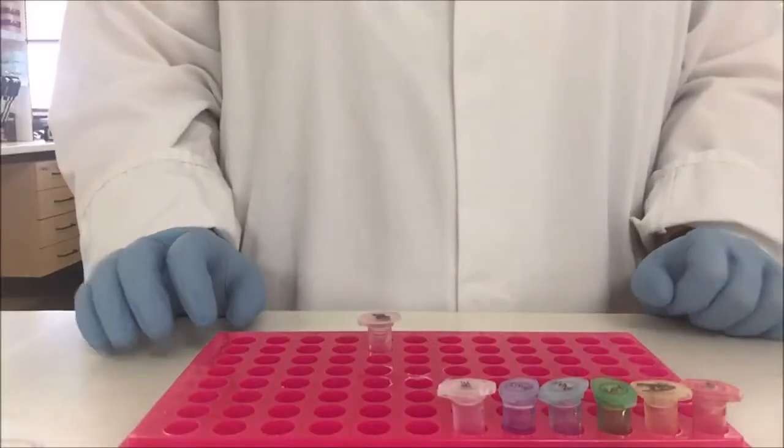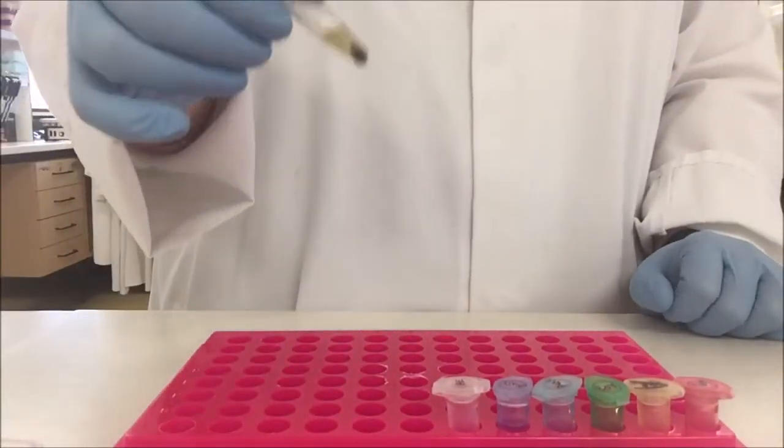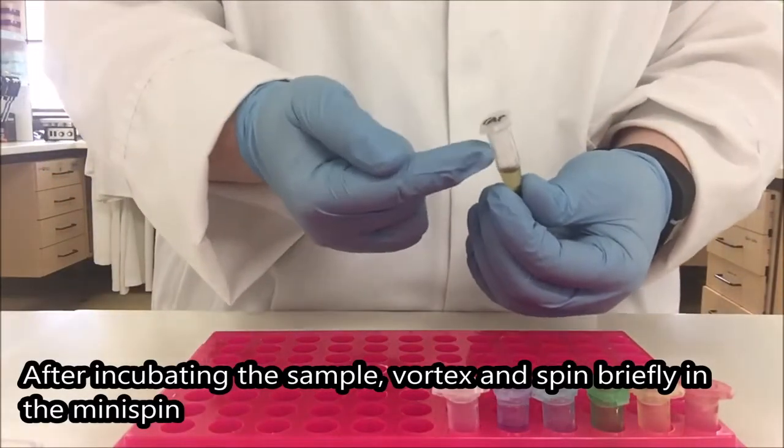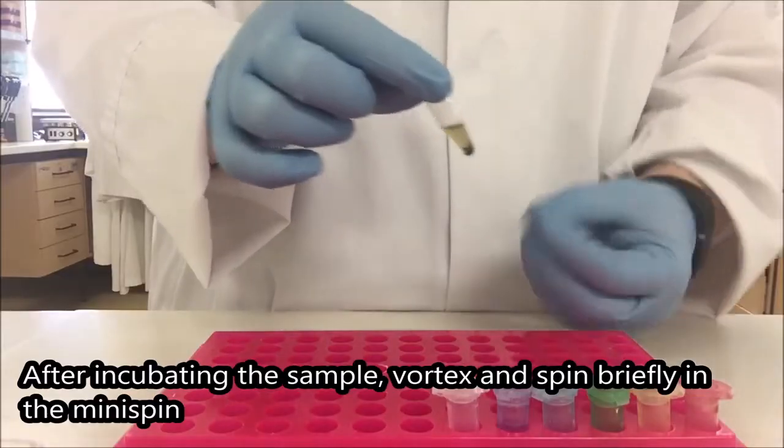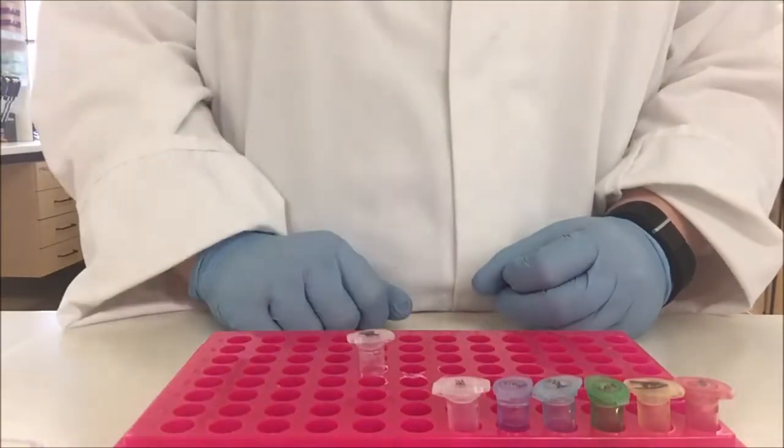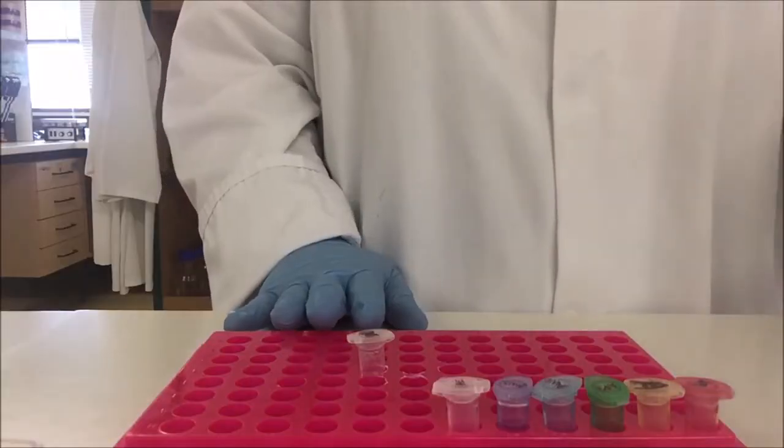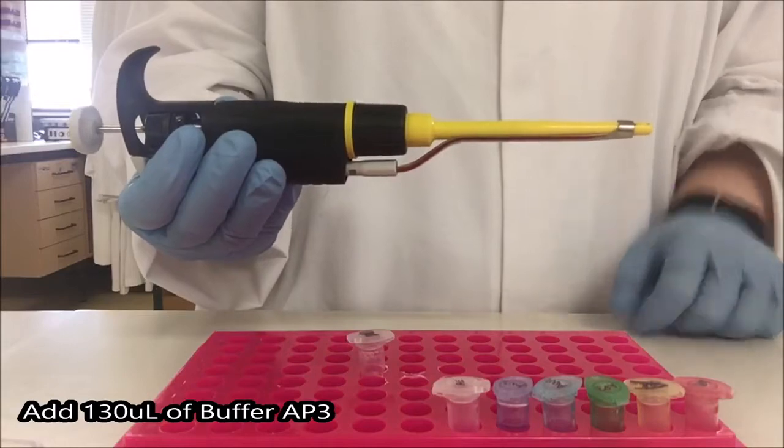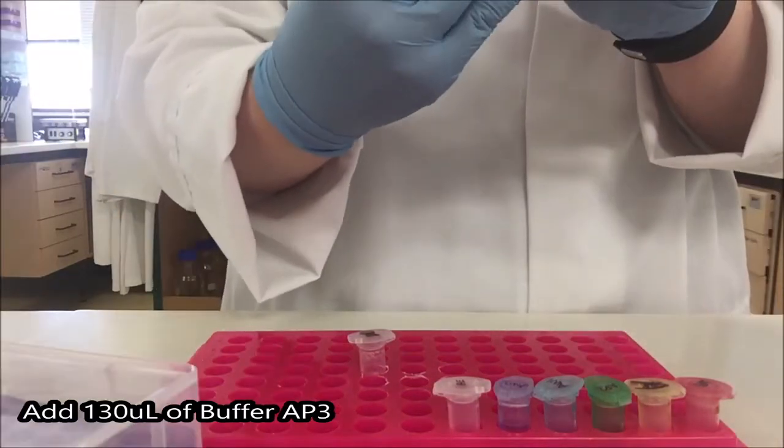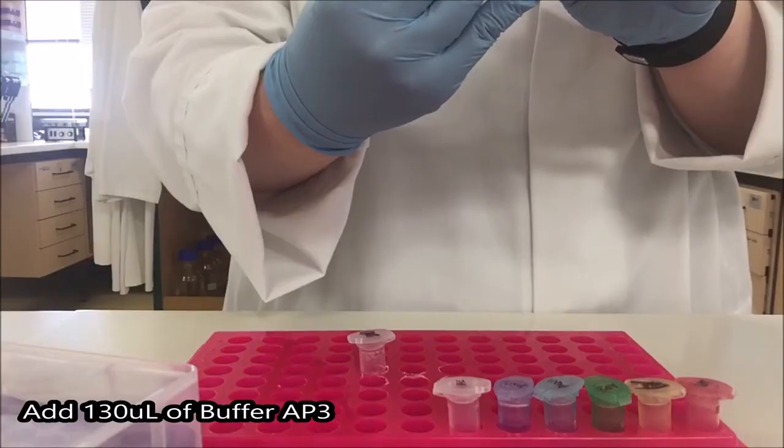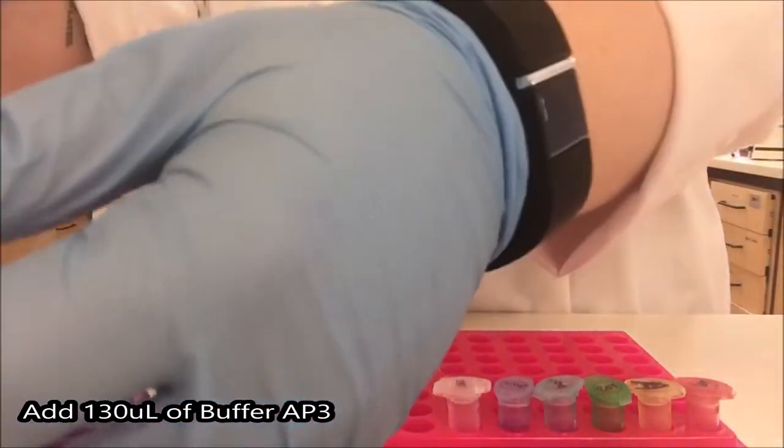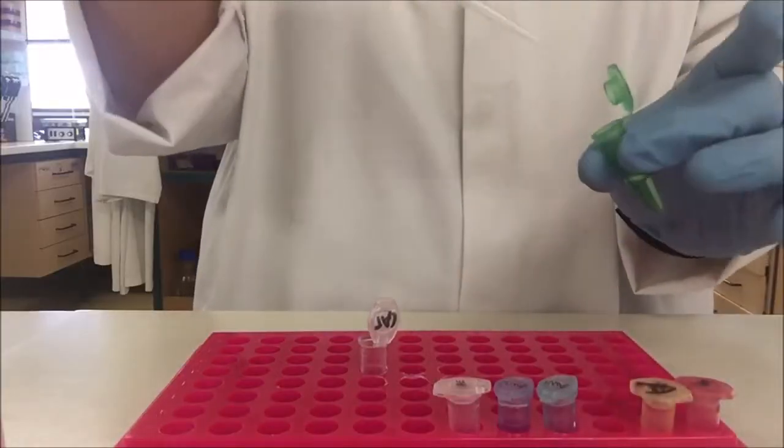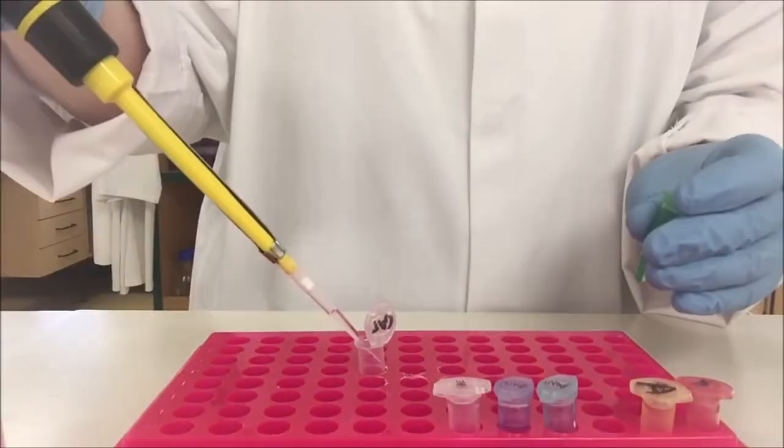My sample's now done incubating. I gave it a last vortex and then a very quick spin in the mini spin to make sure that any material that got stuck to the top of the tube had now been pulled down at the bottom and everything was within the lysis solution. Add 130 microliters of buffer AP3. So I need to use the yellow pipette that has the more blunt end. Set this to 130.